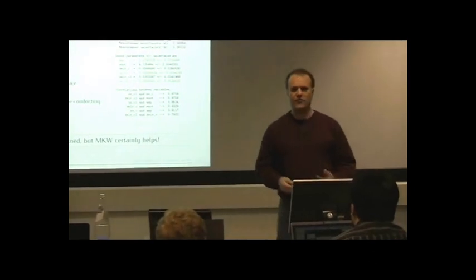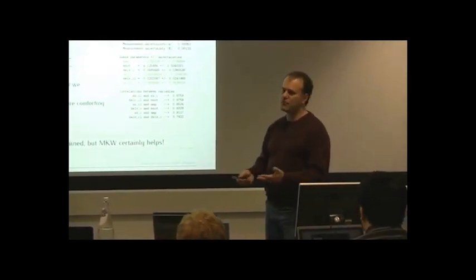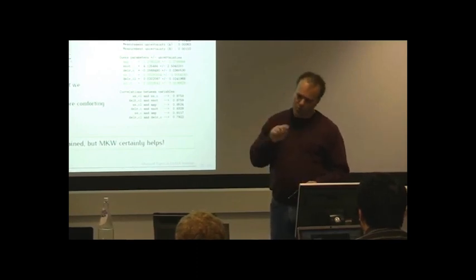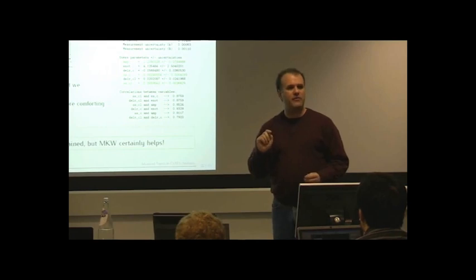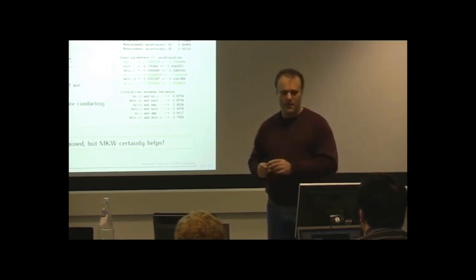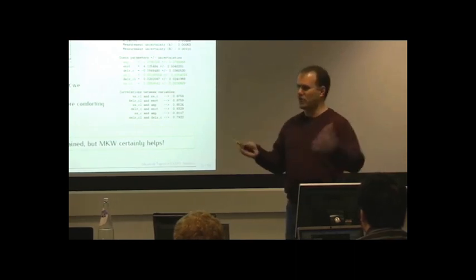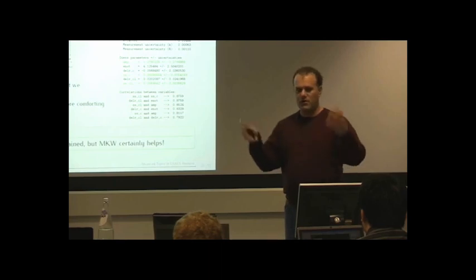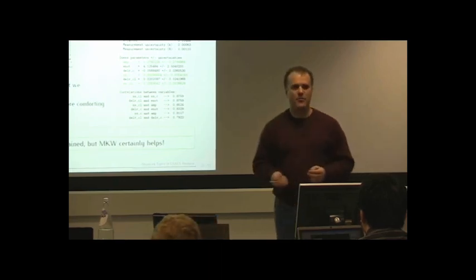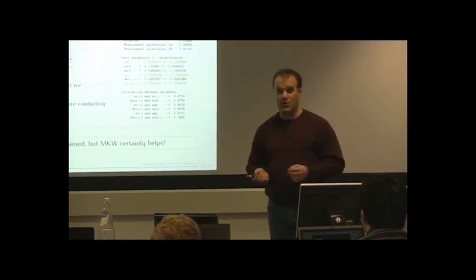And you can see that if you have Artemis open in front of you, on one of the data pages where the fitting k-weight buttons are, they come up by default all ticked on. The reason for that is that after years of practice, those of us at the center of this IFEFIT thing just can't come up with a good reason why you should ever want to do a fit other than in the multiple k-weight manner. So that's now the default in Artemis.